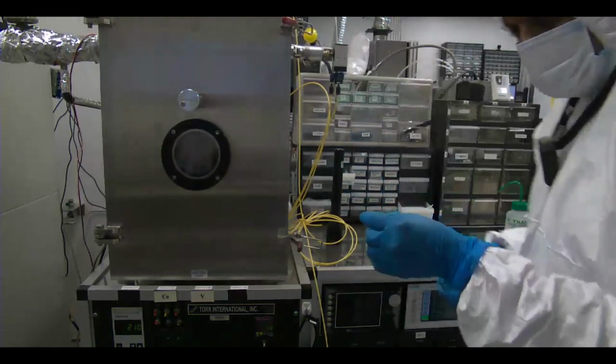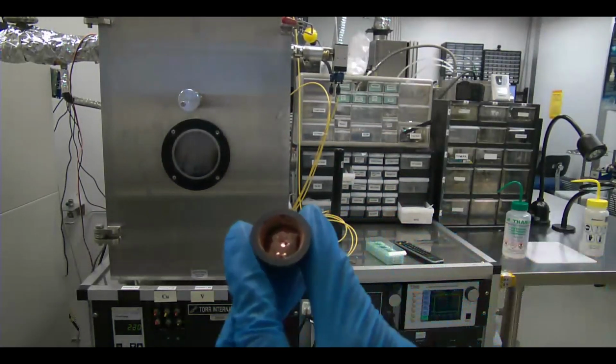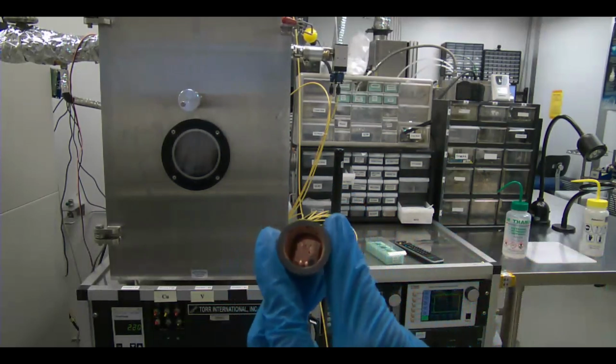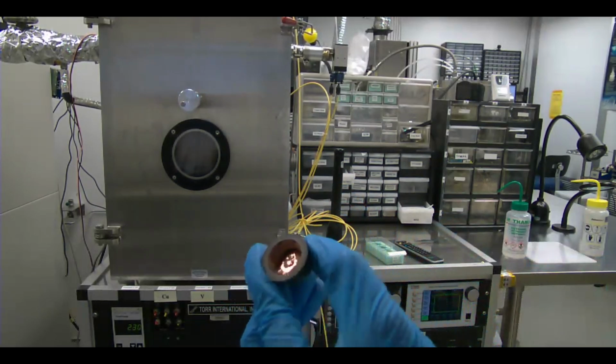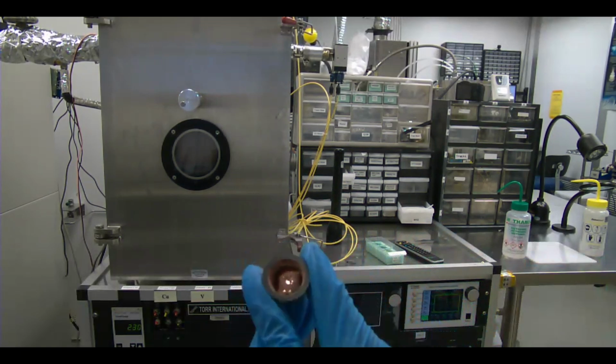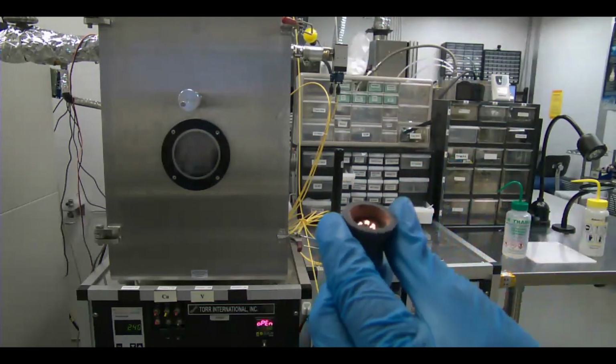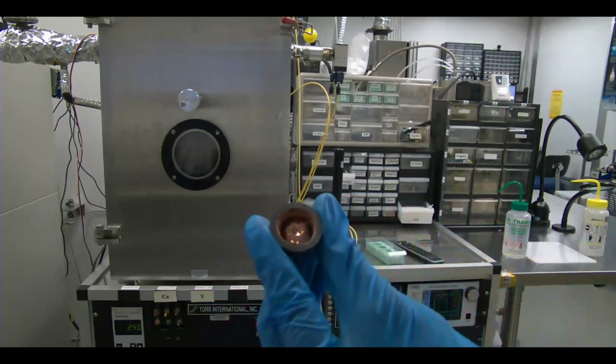So this is a copper. So there's a copper pellet, or actually melted copper, inside a graphite crucible. Why graphite? Well, it'll sustain very high temperatures and it doesn't evaporate. Or we can use tungsten, that's more expensive. So if there's a need, like contamination between graphite and the material is a concern, we can use tungsten.